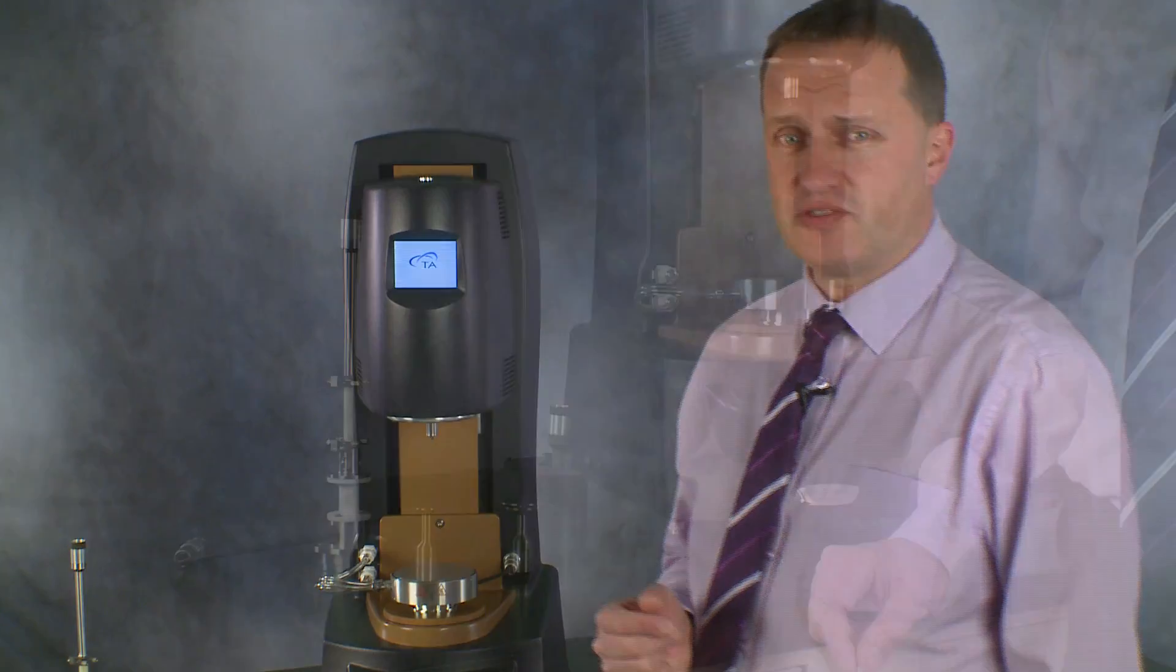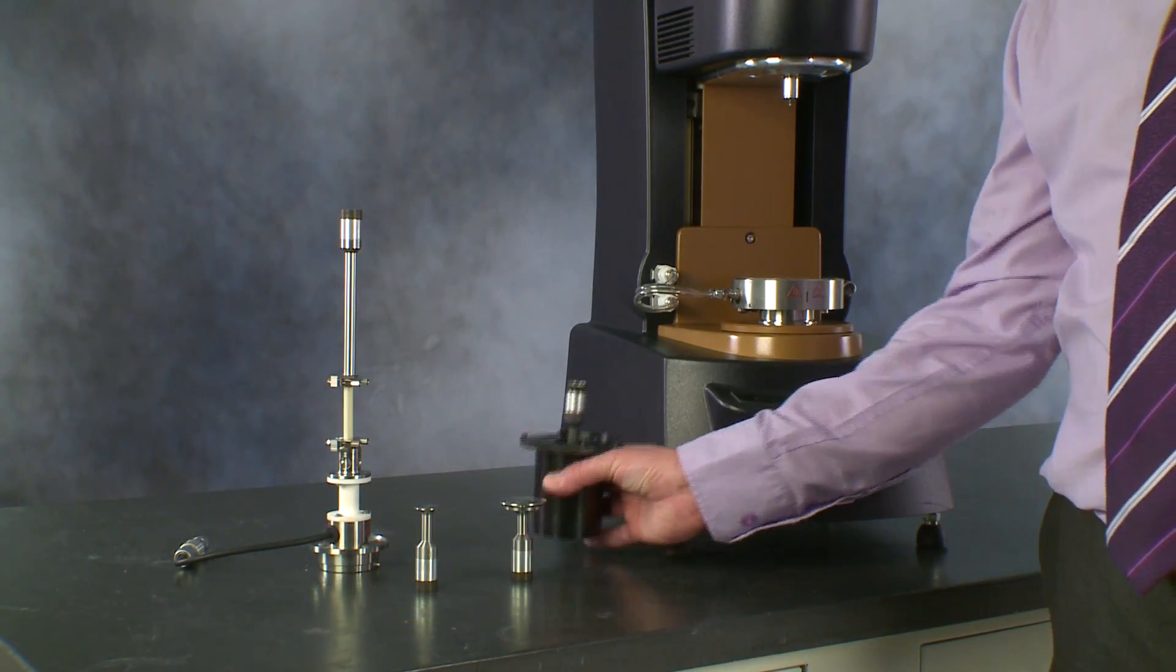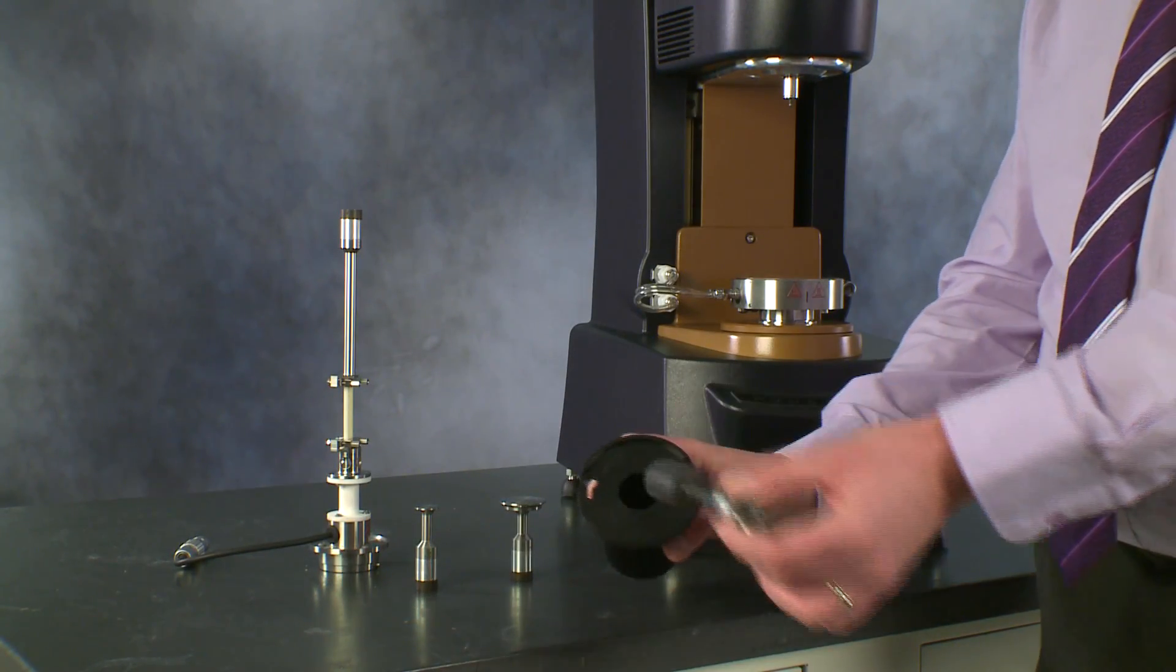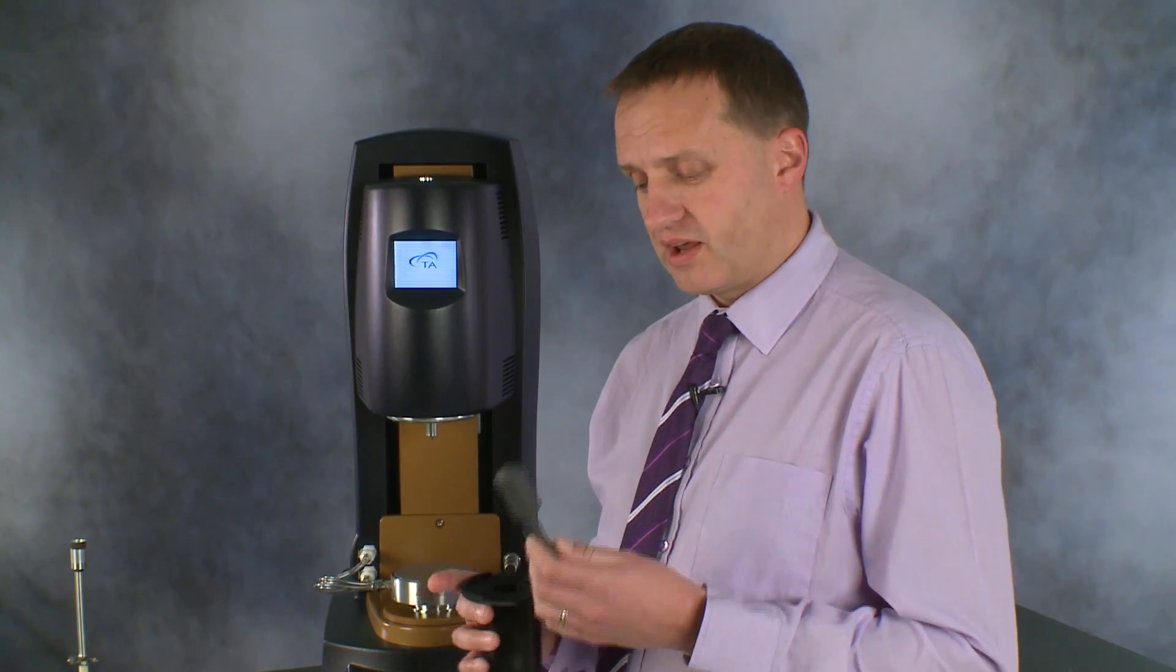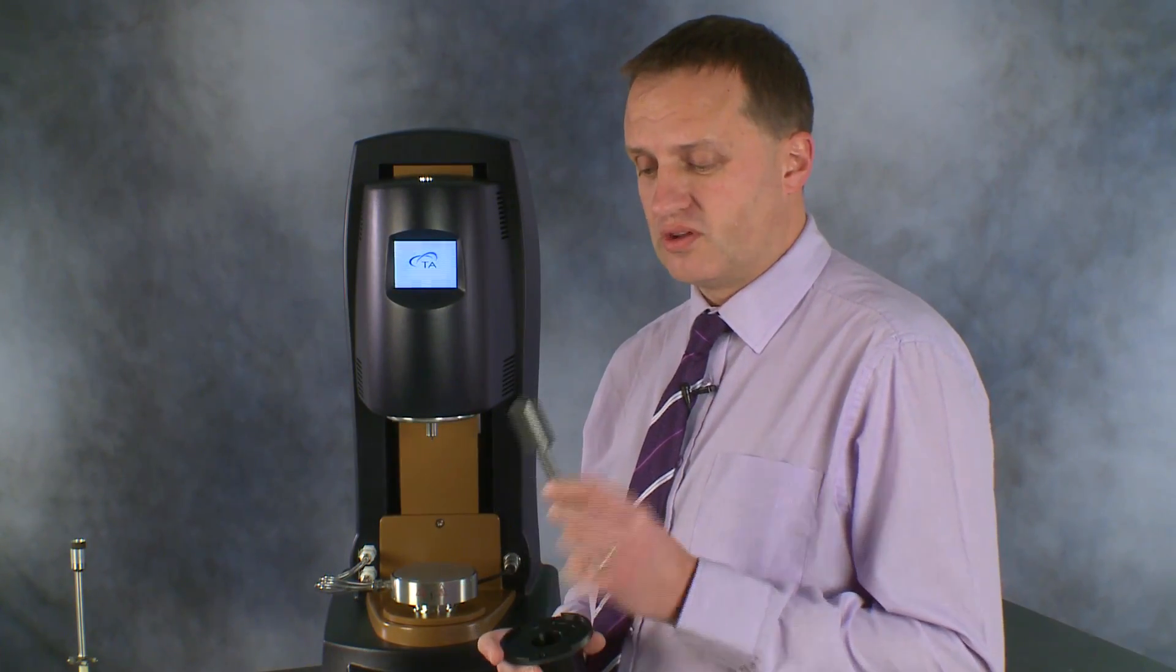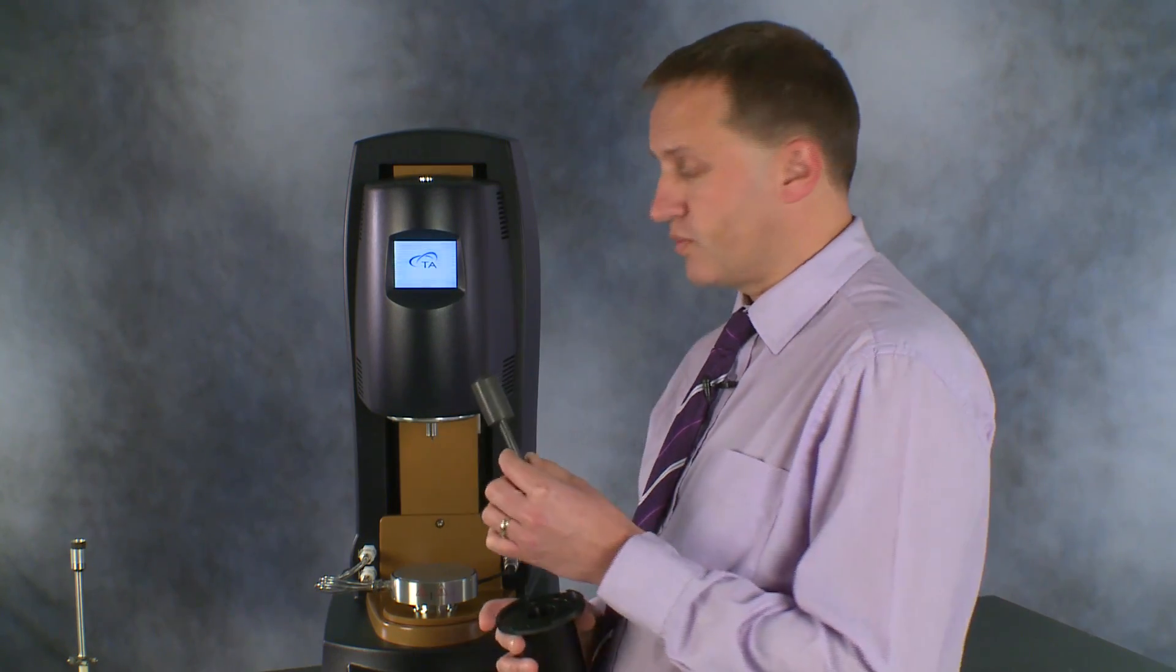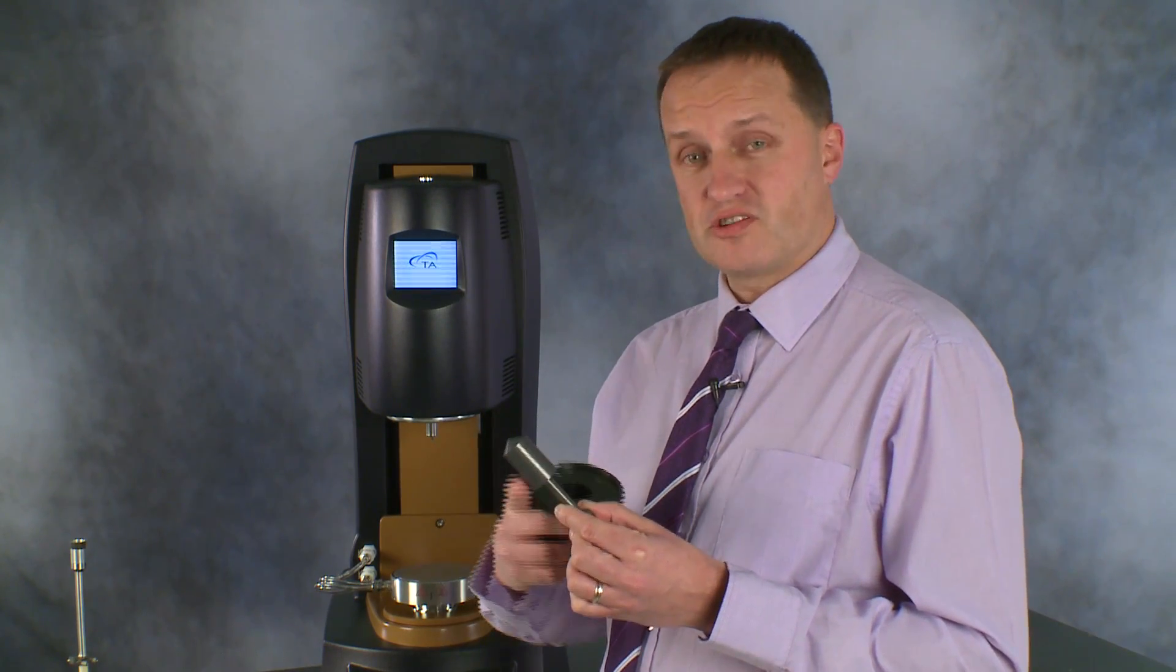The concentric cylinders are usually chosen for low viscosity fluids because the sample can be contained within a cup and it gives us the largest surface area to deal with for being the most sensitive. The instrument will apply a force and it's applied over the largest surface area.